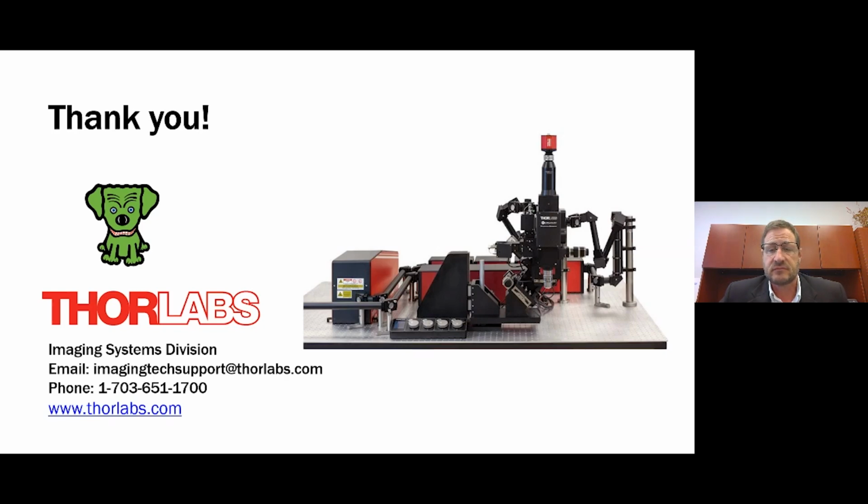Is it possible to do FLIM with a 1-photon laser? It is, however, typically it's done with a slower laser in the picosecond range, and then the decay is measured afterwards. But of course, with a picosecond laser, the 2-photon effect doesn't occur. This is more of a CW excitation that is just pulsed.